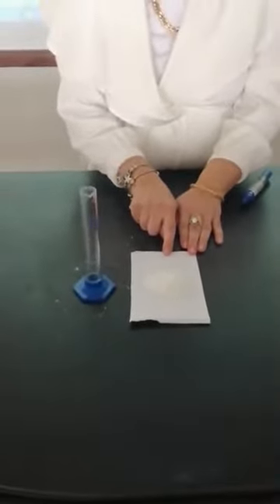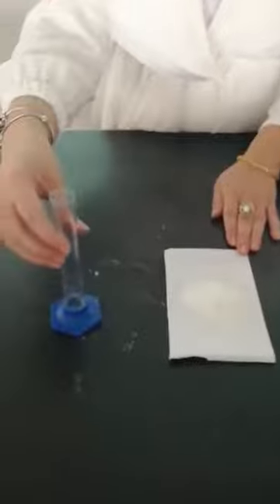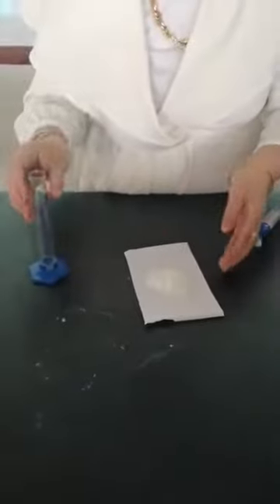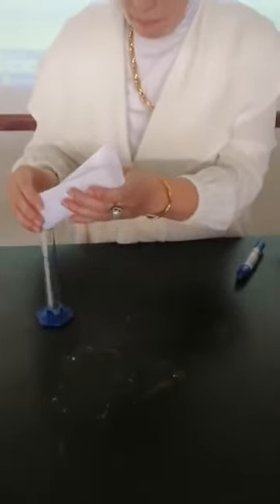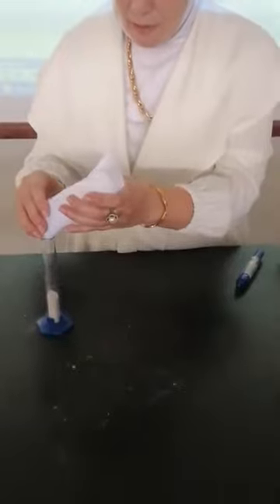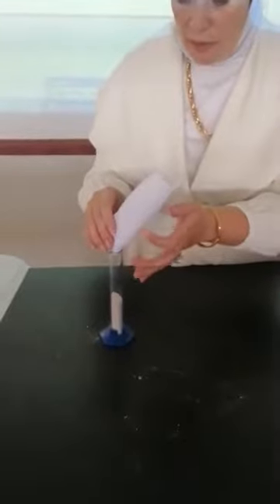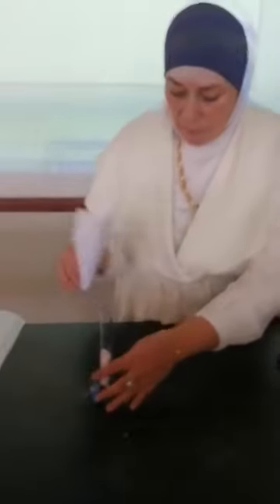So starting with measuring tap density and bulk density, we need 10 grams of zinc oxide and a 25 ml cylinder. I need a watch. Just roughly add the powder to the cylinder and read the volume.